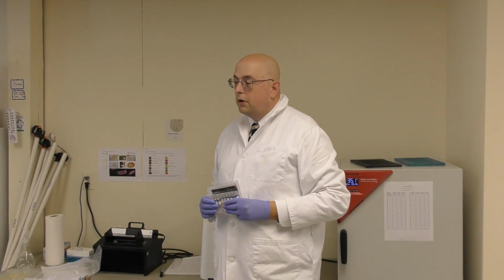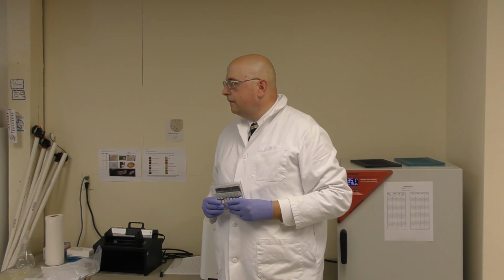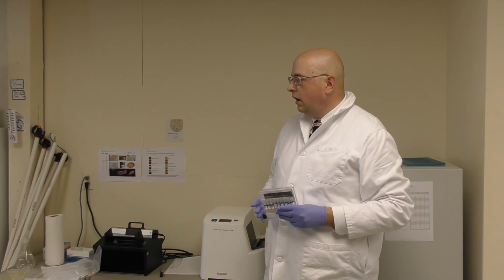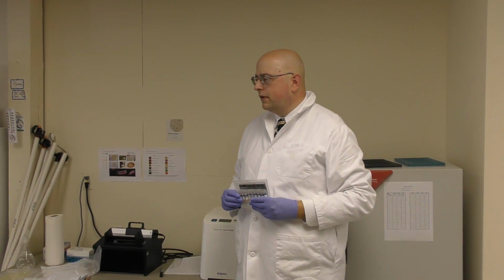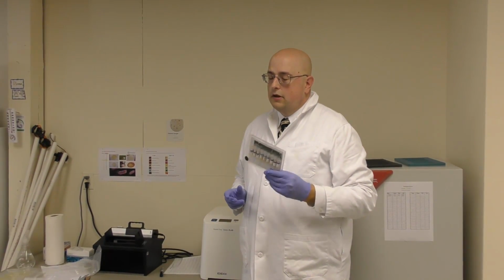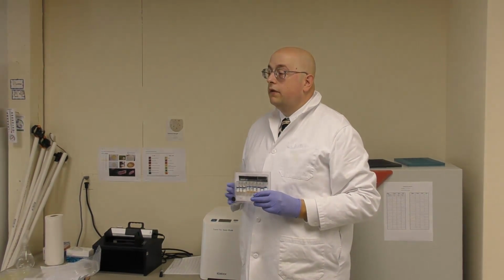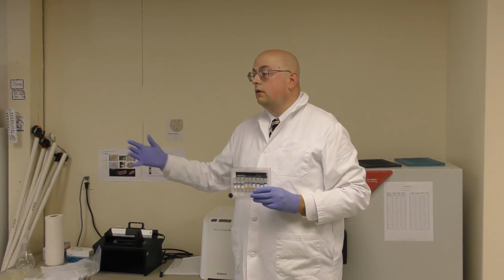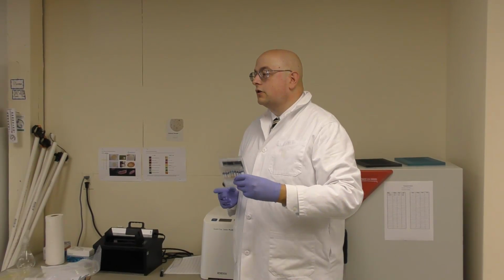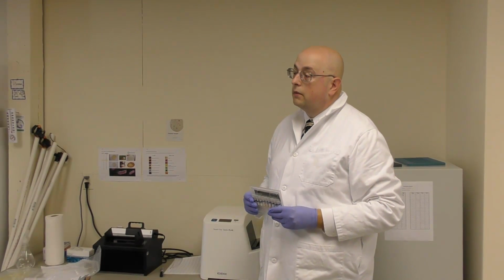How many vials are a lot of the media? The Colilert, I mean, they make them into huge batches. I think all the batches that RCA has purchased, there's about 200 samples worth. I think they all came from the same lot. So you could do this one sample at a time, but since you have 3 of these and they have a 6-month or so shelf life, it wouldn't hurt to run these even through the same lot periodically. I would recommend it at least twice a year to test that technician, or if you're bringing a new person on board, you can use this as a form of proficiency check for them.